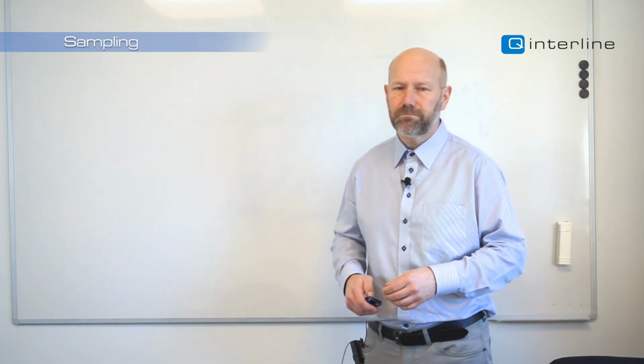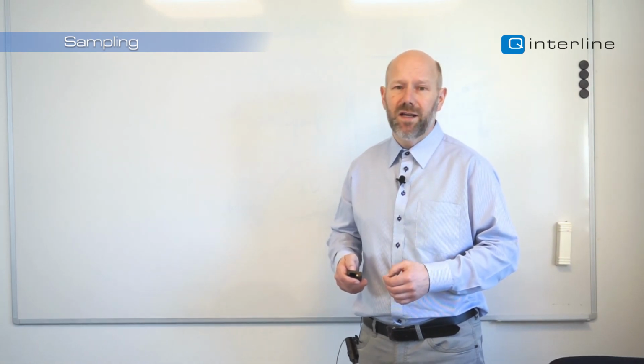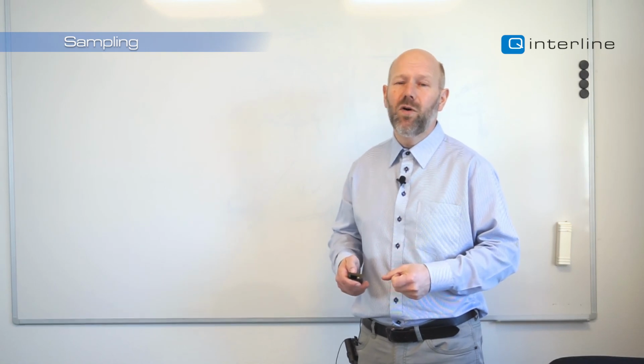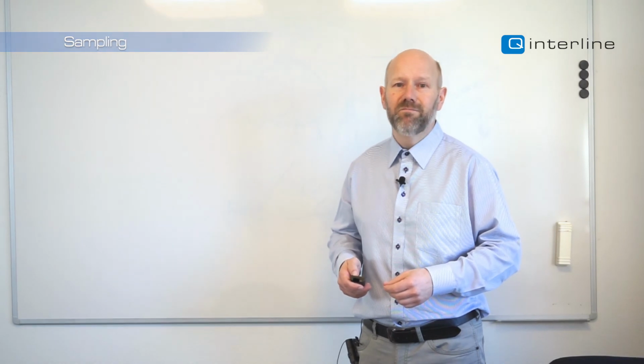That concludes part 3 of presenting a sample to an analyzer. I hope to see you back in video number 4 on the topic of taking a spectrum. See you there.